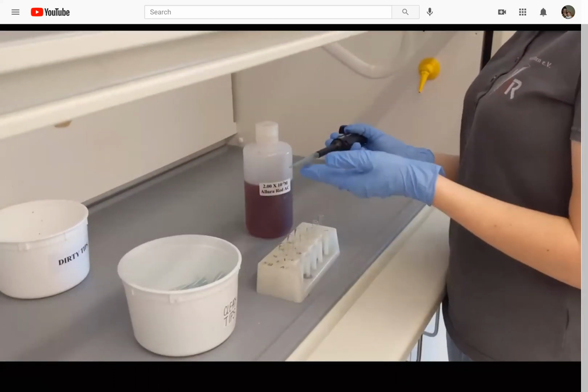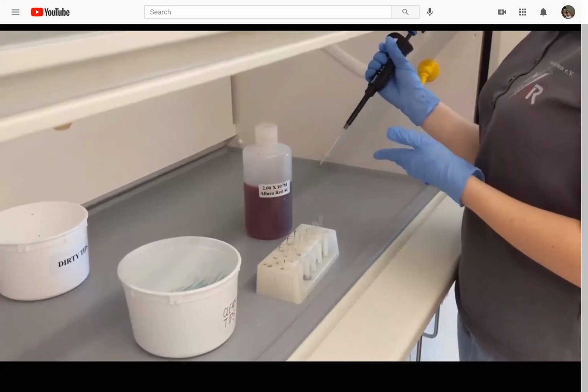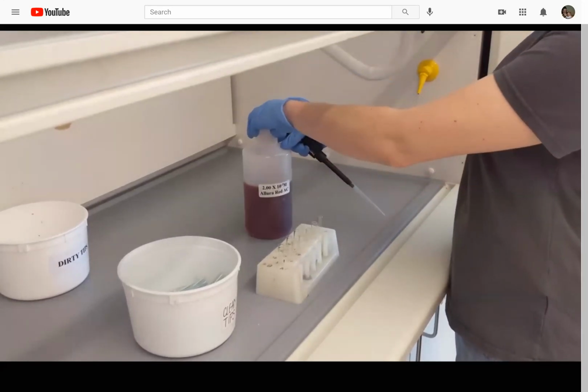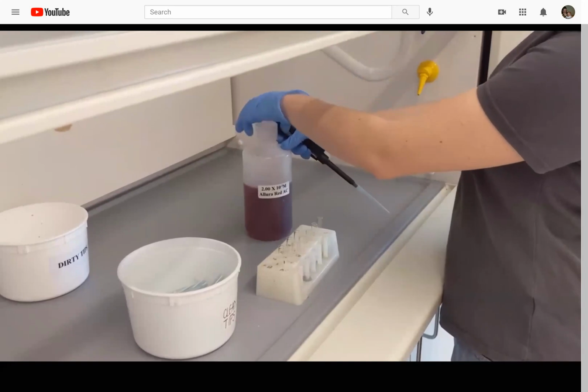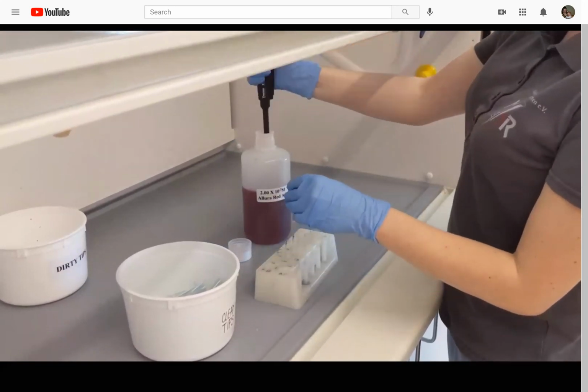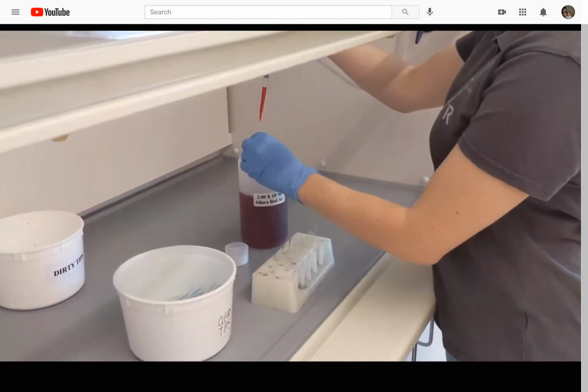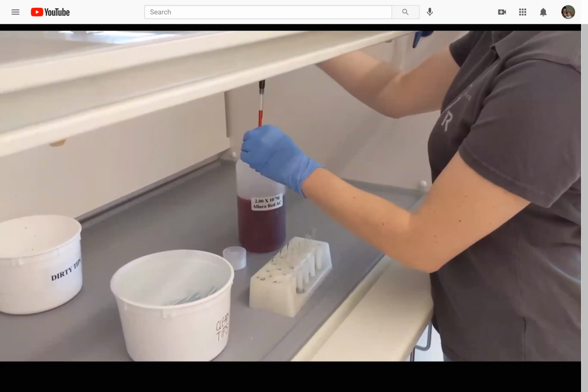All right, so now I've gotten a clean pipette tip. I'm now going to obtain 2 milliliters of my standard. As you notice, that is a bright red solution.